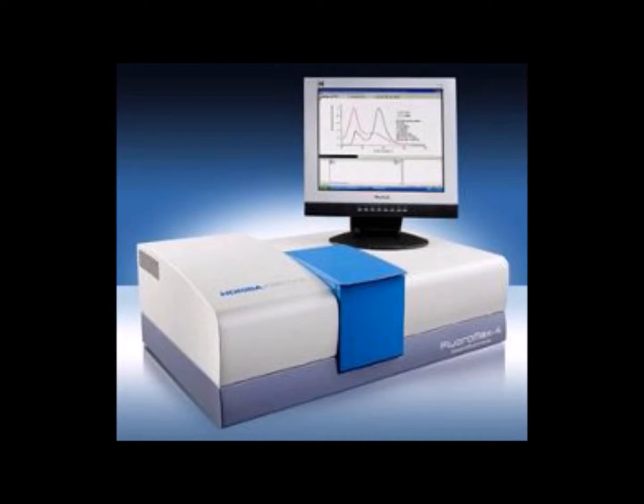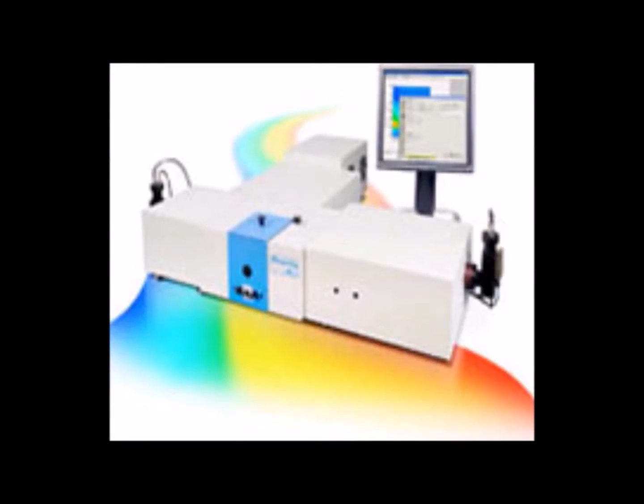Spectrofluorometric DNA quantification. Ethidium bromide is useful for this quantification. It permits a great sensitive fluorometric measurement. The best results are reported with 5 micrograms per milliliter and using an excitation of 546 nanometers.